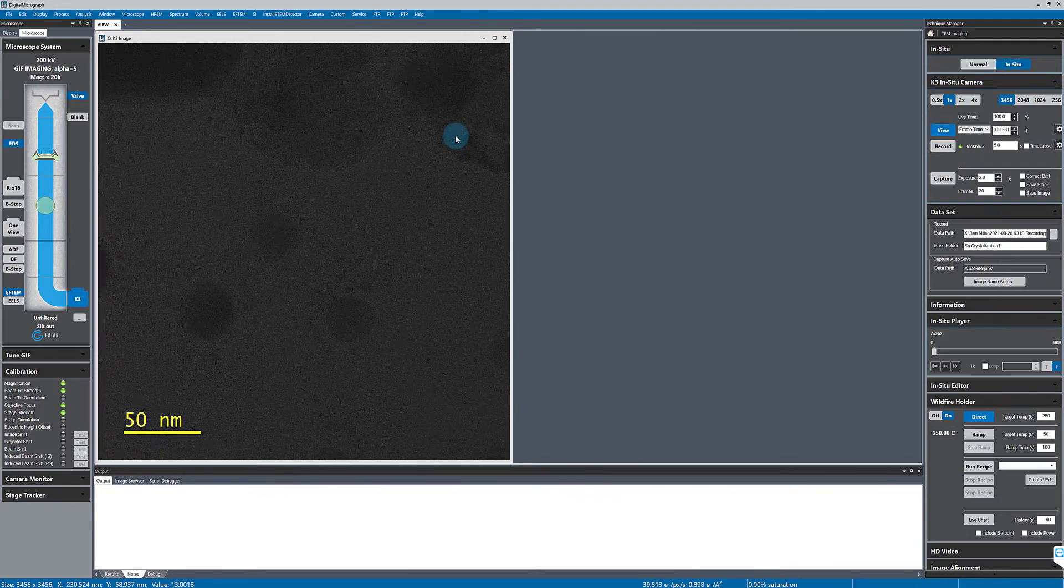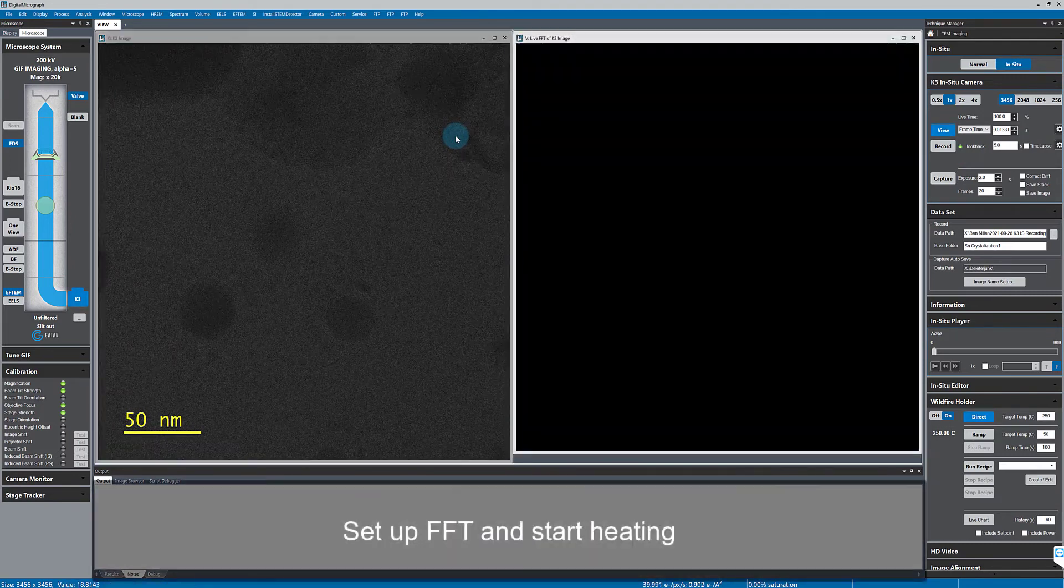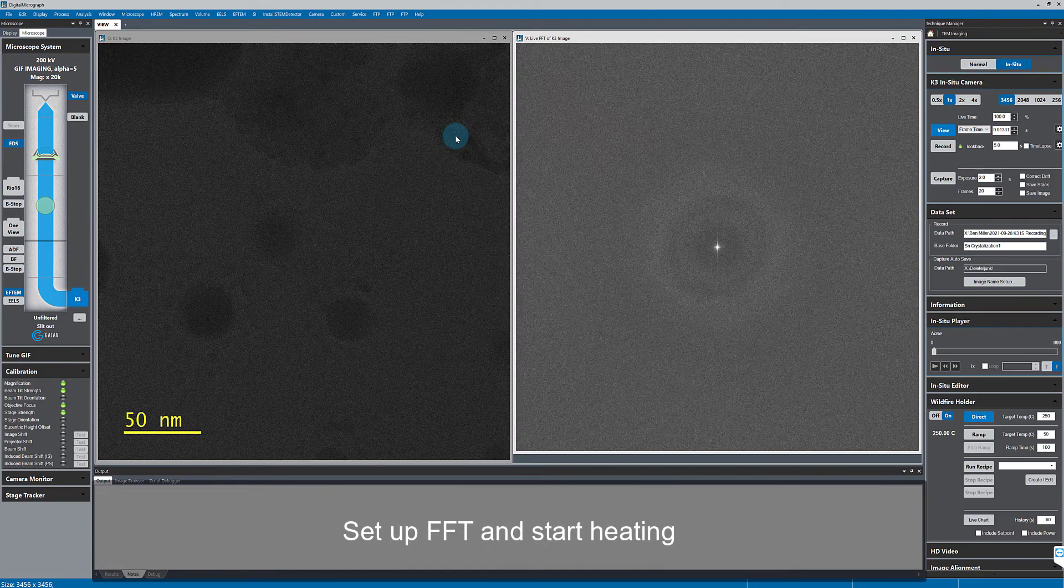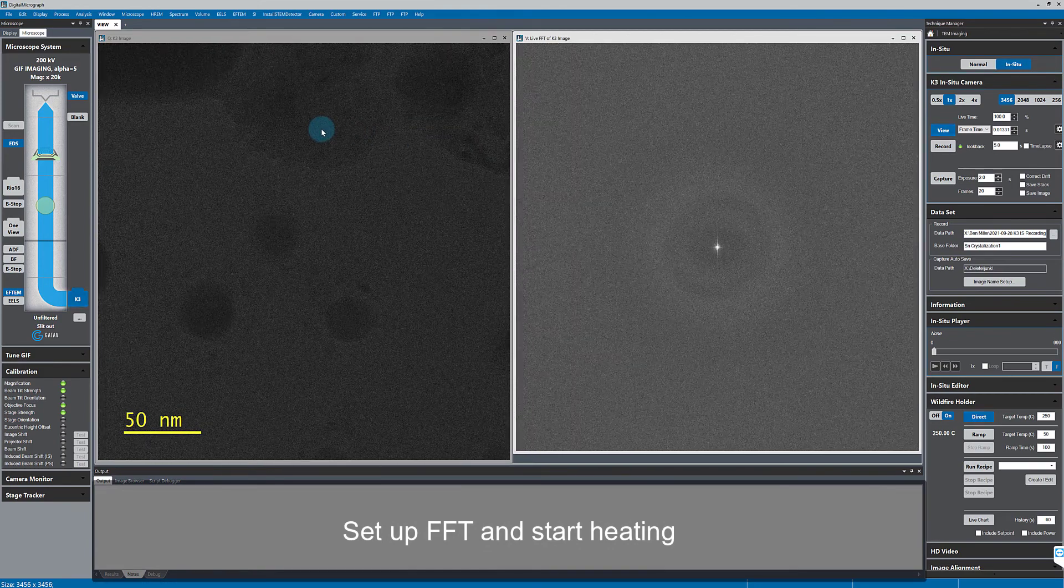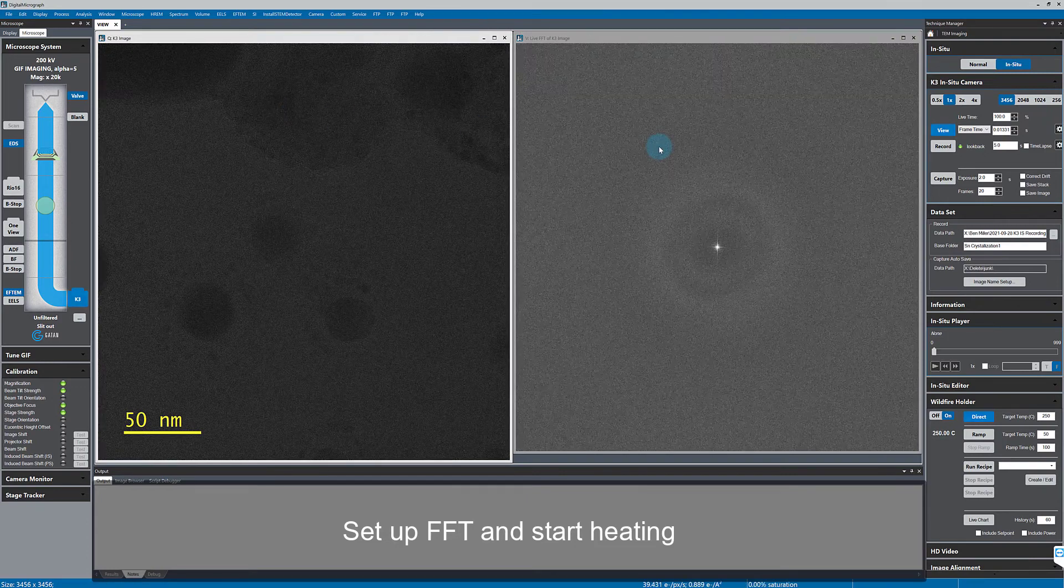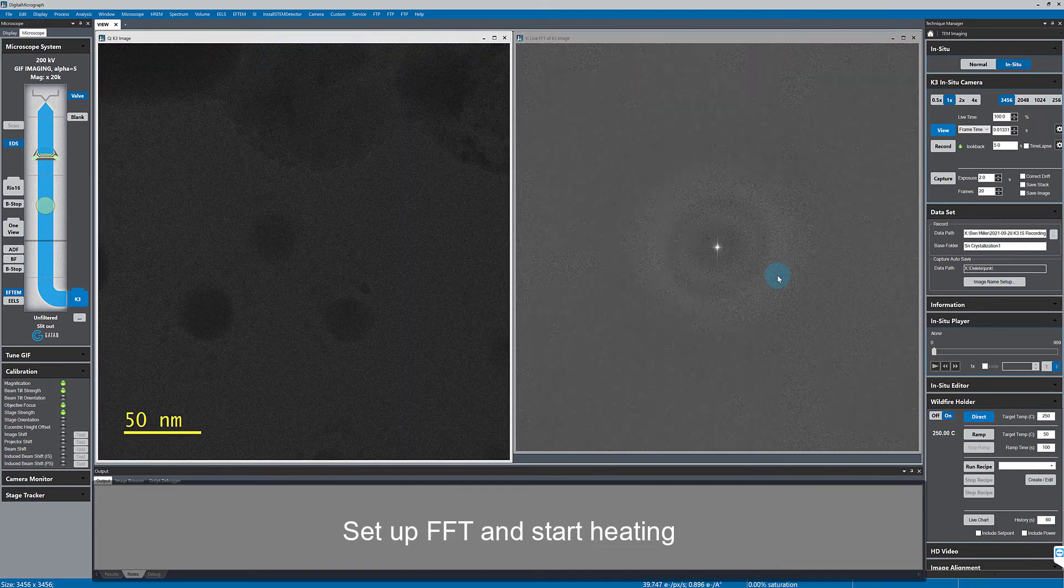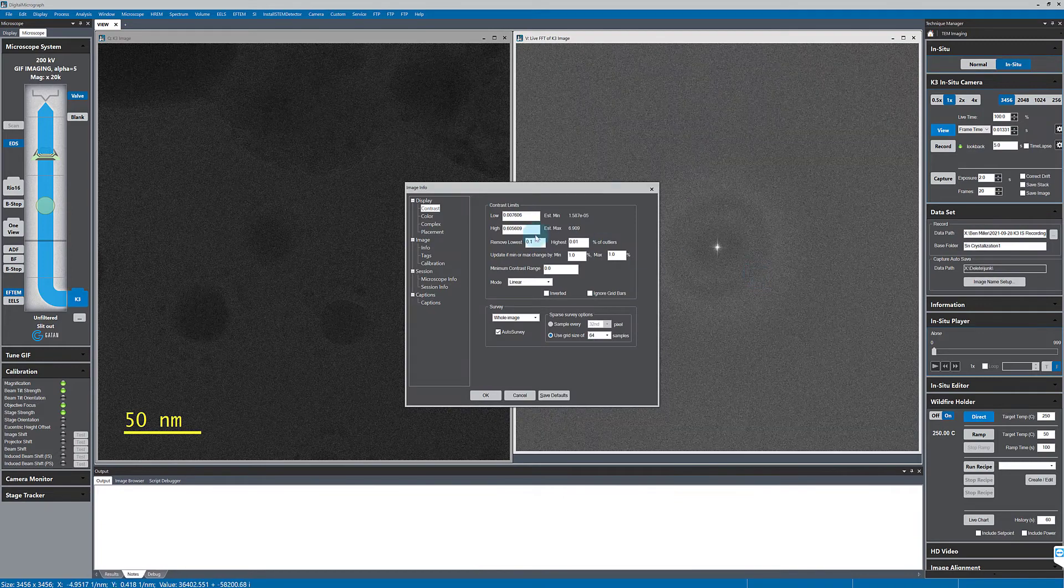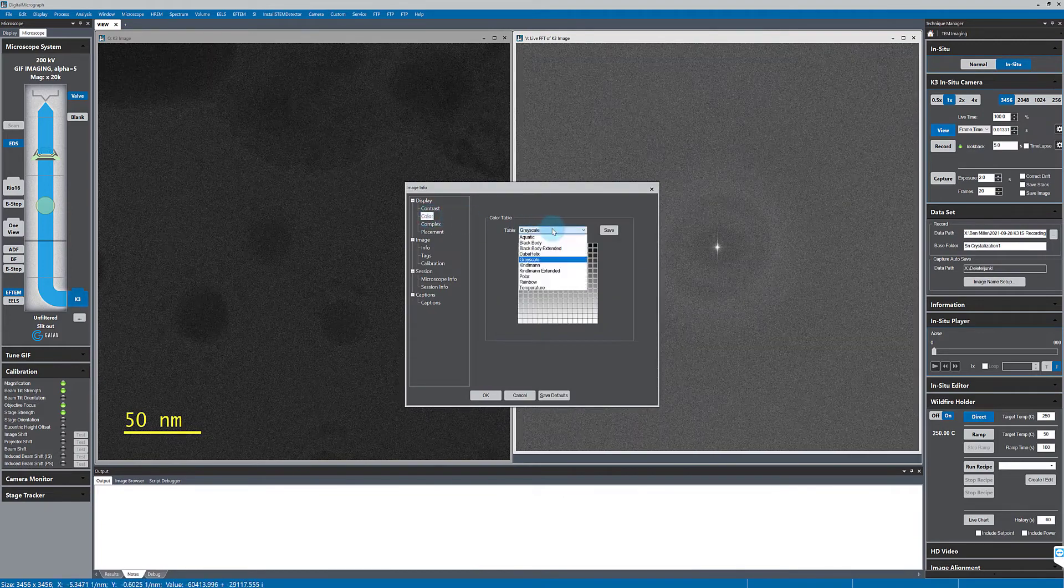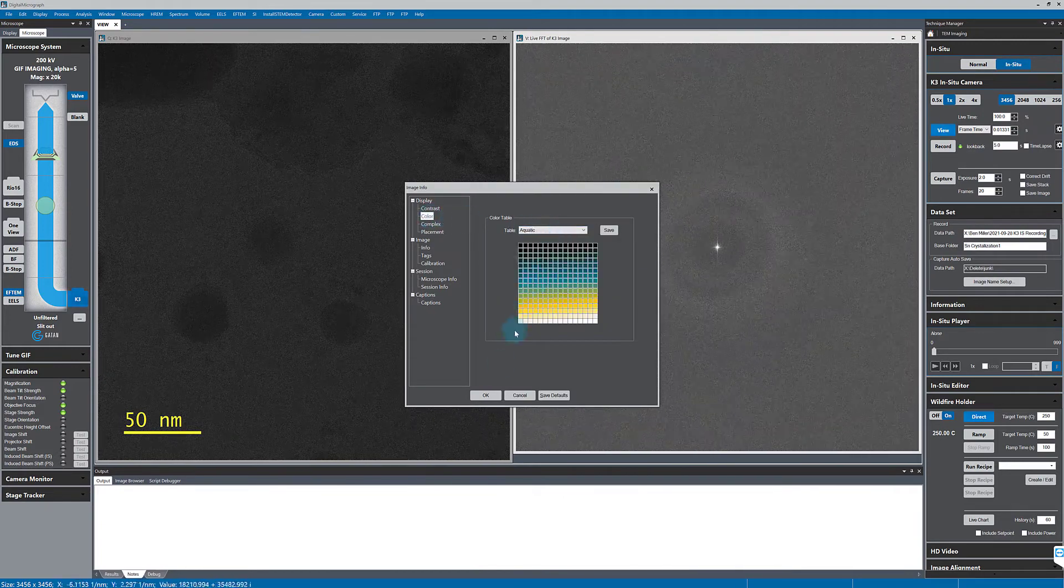Now I'm going to start the live FFT as well so that we can see what's happening to the sample. Right now, the tin is melted at 250 degrees C, so I don't expect to see any lattice fringes, and I'll just change the FFT to a nice vivid color scale.